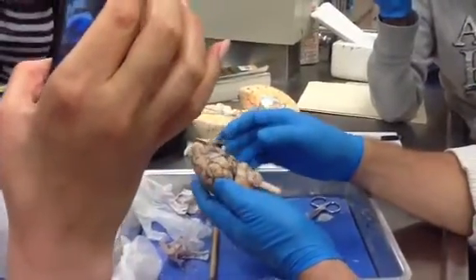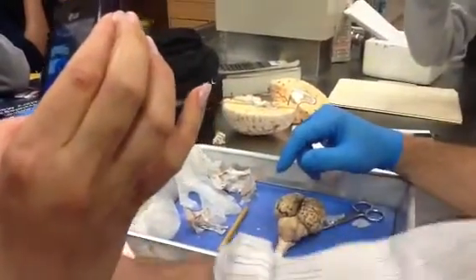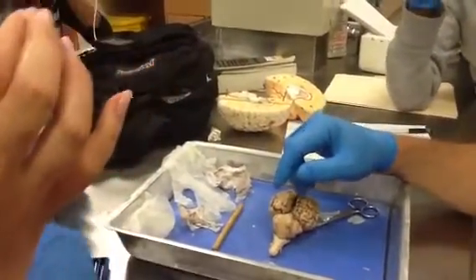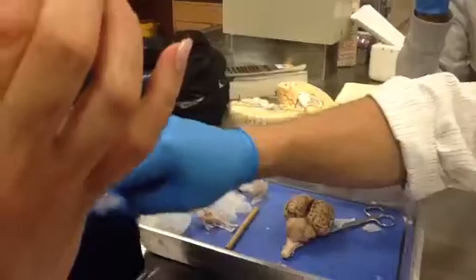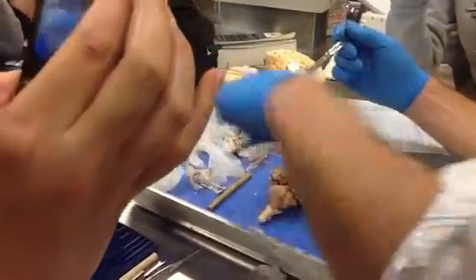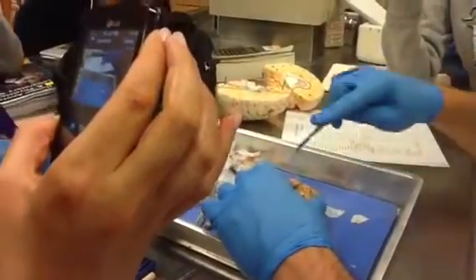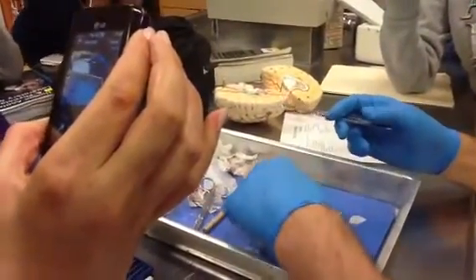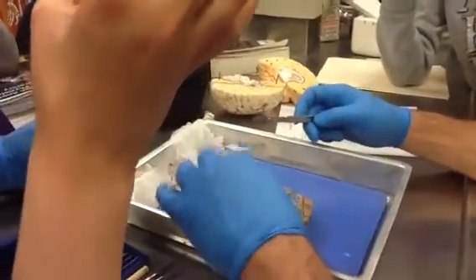Post it. Okay. So what you're going to do next, once you identify all the structures on the outside, is to take the scalpel. Just grab yours here. And this part you got to be a little bit careful because you don't want to start slicing the thing up. It's a nice new blade at least, but I would like to get these longer blades because you don't want to be cutting again and again, because you're going to slice on different planes and it's going to chop it all up. So you want to try to make one clean cut or just a couple, but be real careful that they're in the same plane. So the way that I like to do it is I'm kind of spreading the cerebellum. You don't have to worry about too much. We'll cut that after. But the cerebrum, I just kind of go into the longitudinal fissure, and these should be nice sharp scalpels.